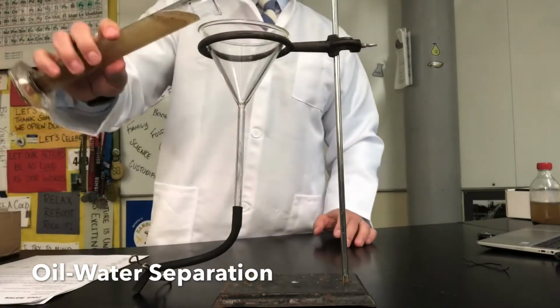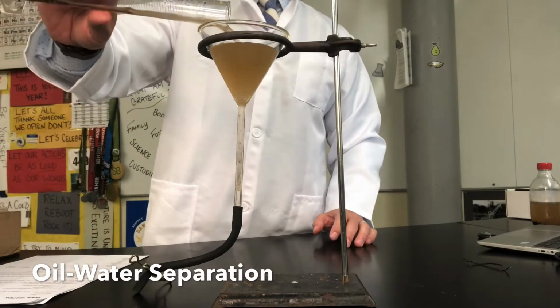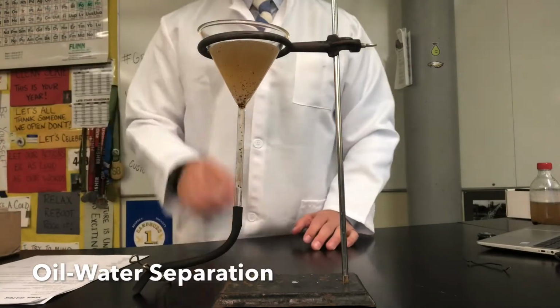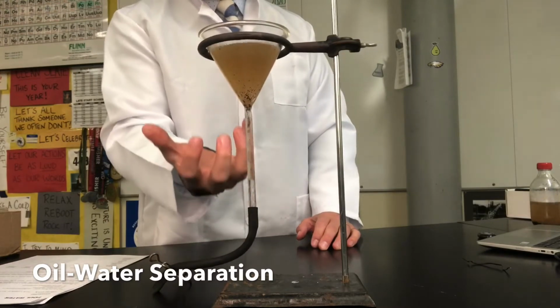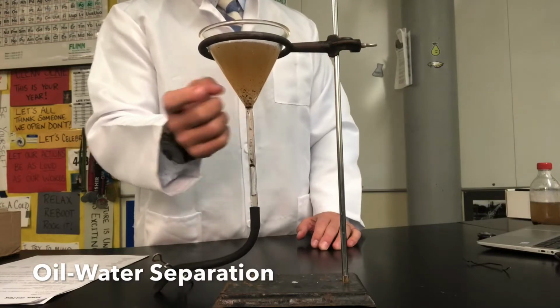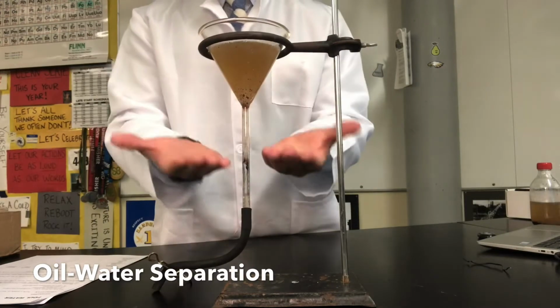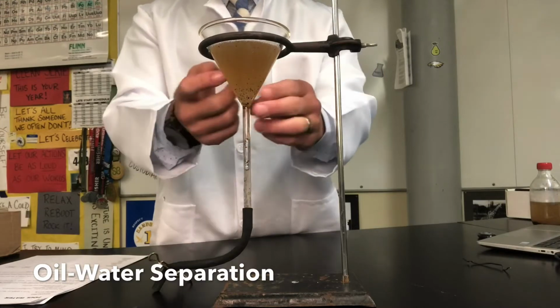I'm then going to take my oil and water sample and pour it all the way into this funnel. What I'm then going to do is give it a little bit of time, and let the oil float to the top as the more dense water sinks to the bottom. So I'm taking advantage of the difference of their densities so that eventually I can get all the oil to the top and physically separate the water towards the bottom.